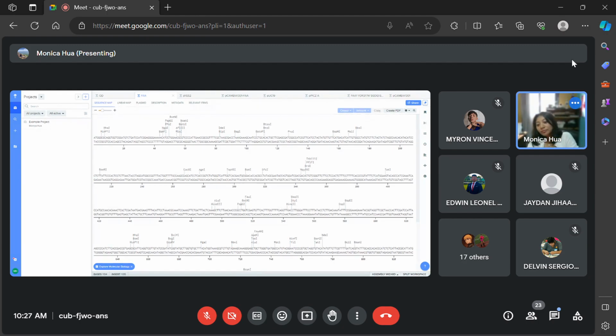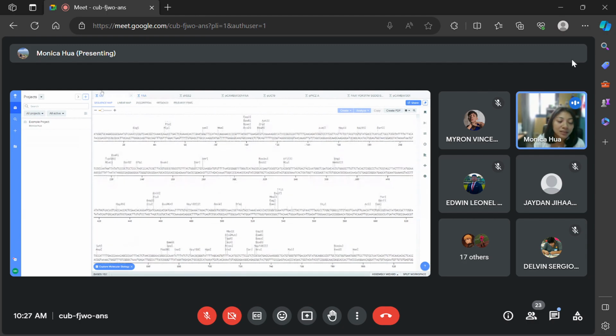Okay. All right, guys. So now what I want you to do is to insert this sequence, your OD. I have another sequence open. OD stands for oleate desaturase. It is an enzyme I worked on before, so I'm giving you guys to work on it now. It's a troublesome enzyme. I hate it. But, oleate desaturase, this is a sequence. I want you guys to insert this sequence into a specific vector.